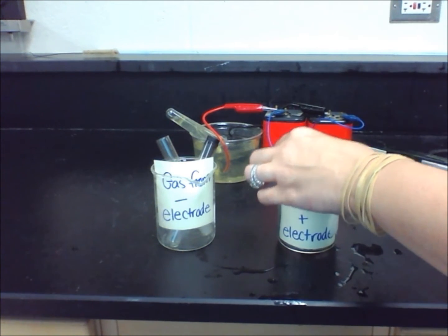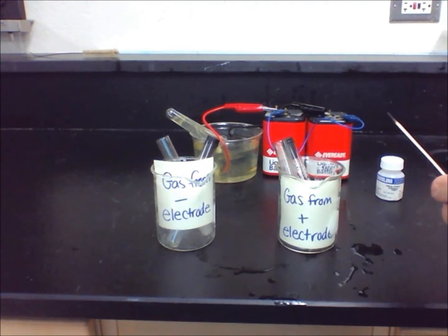When I test the gas collected from the negative electrode in tube 3 with a glowing splint, you will notice that the splint goes out.